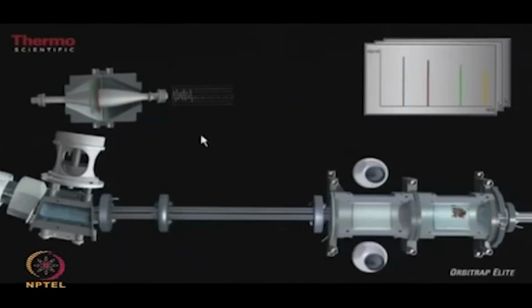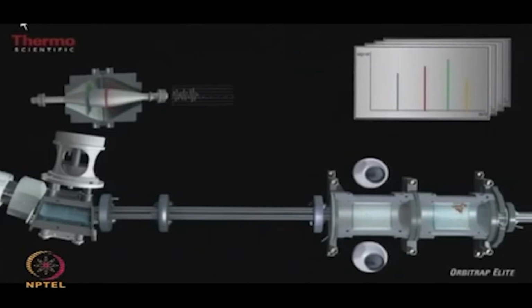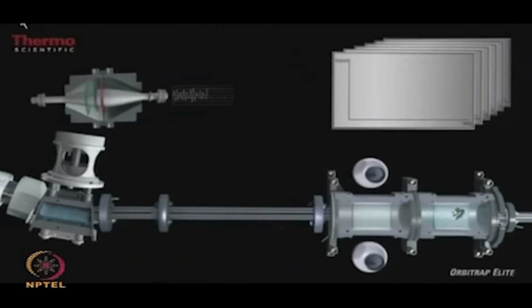If you want to work with the linear trap and the Orbitrap at the same time, you can run both at the same time. In the linear trap, the ions get stored and fragmented, and then they are sent into the Orbitrap. So you can have the full scan MS as well as full scan MS/MS at the same time. In addition to the full scan MS and MS/MS, you can also have a low resolution scan from the linear trap. So this is what you can obtain from the Orbitrap.